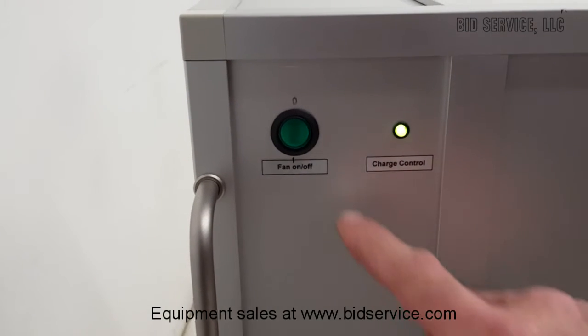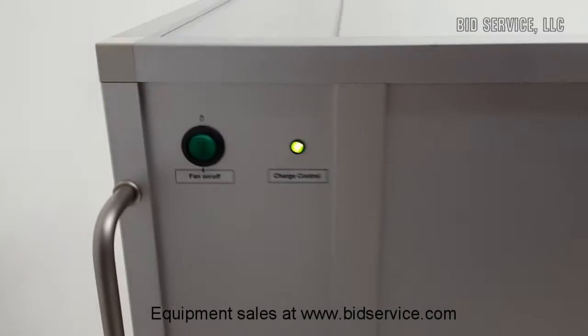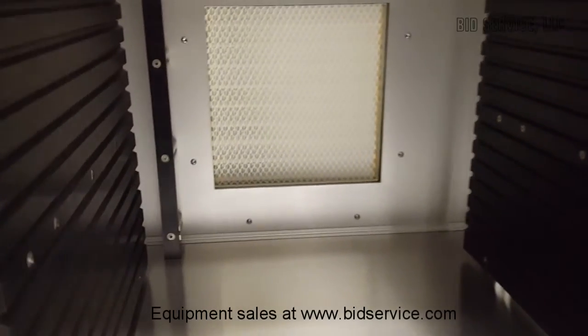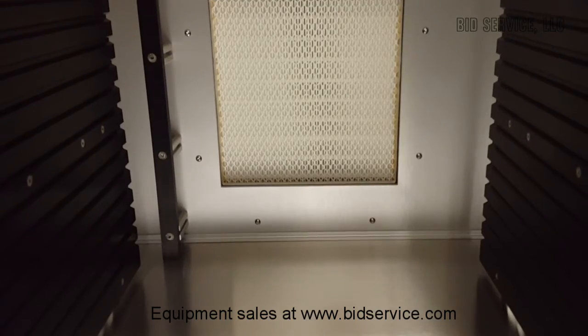Over here is the fan on and off switch. I'm going to turn it on. You can hear inside the fan is running. There's a small HEPA filter right there.